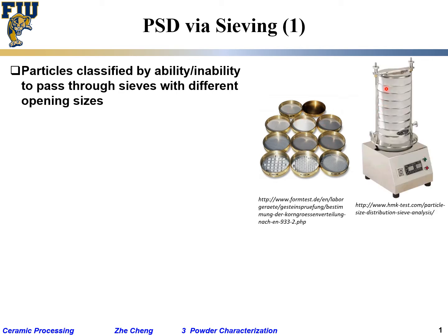And then quite often people stack them up together onto a shaker. It would vibrate and shake, and the powders you put initially at the top would gradually drop, right? Depending on the fineness of the sieve, the finest would drop all the way to the bottom, and the most coarse would be on the top, just by gravity. Very simple stuff, and you do see them in some industry productions with essentially the same principle.